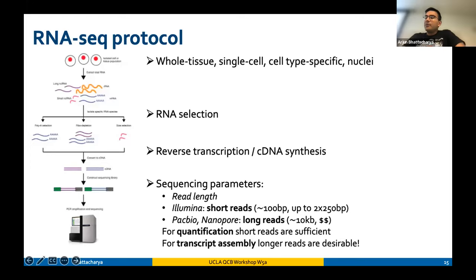Yeah, so it depends on what you mean by unwanted RNAs. Say you don't want to include lots of these small RNAs, you can do a ribodepletion or a poly A tail selection with some specific kits. But if you want to avoid, say, all genes that code for cytokines, that's something that I'm not fully aware is possible pre-cDNA library synthesis. There are other kinds of assays for transcriptomics that can allow that.